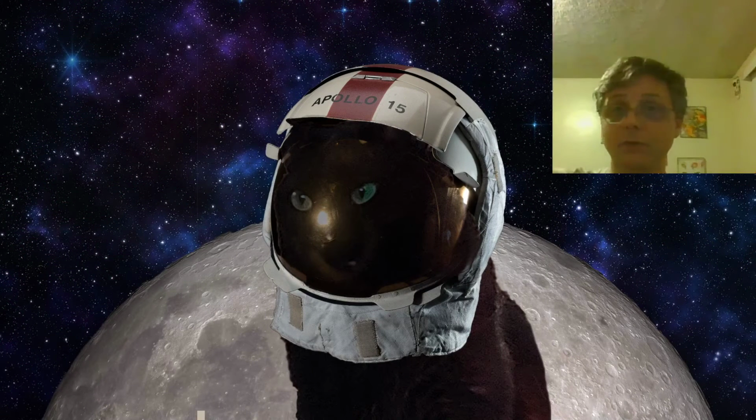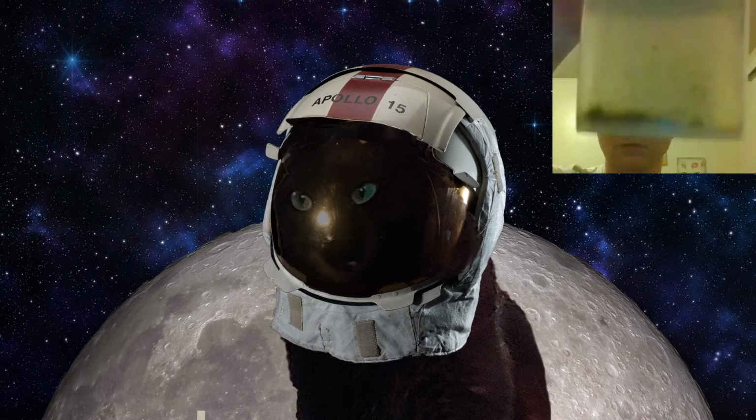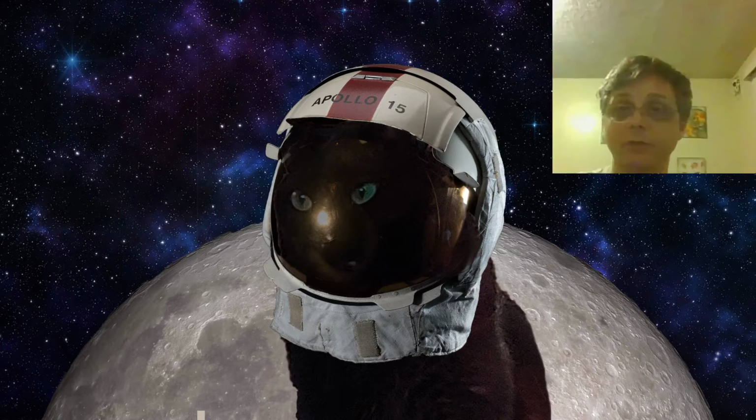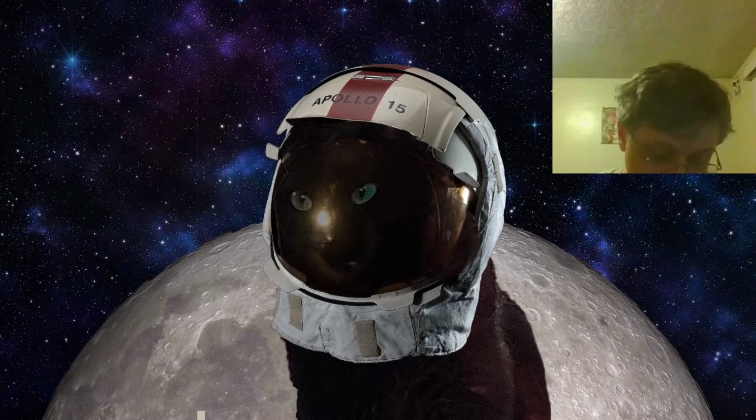But I will look. We're going to look at another one of these samples. This is moss that I found growing directly on the concrete, so I think it's a different kind of moss.